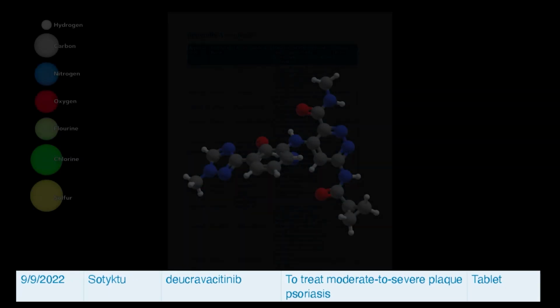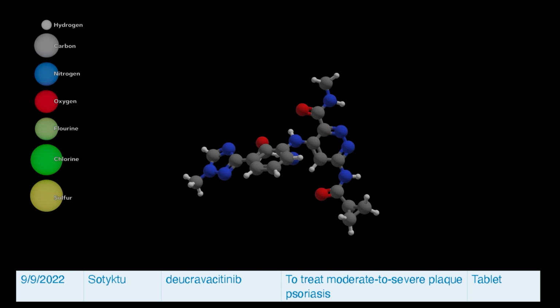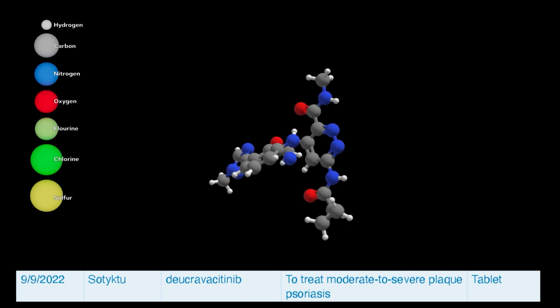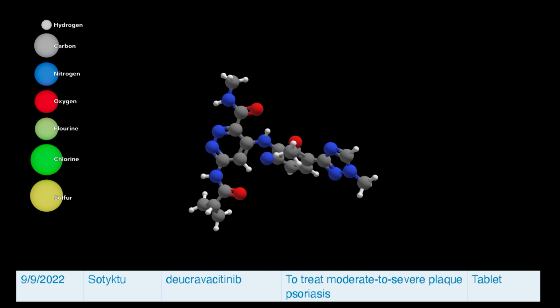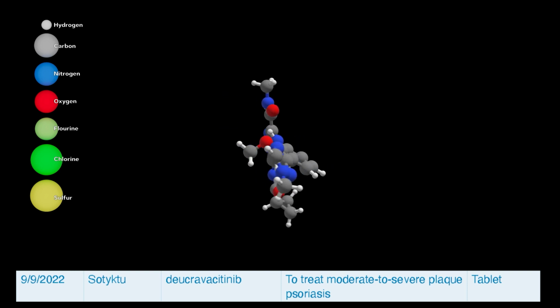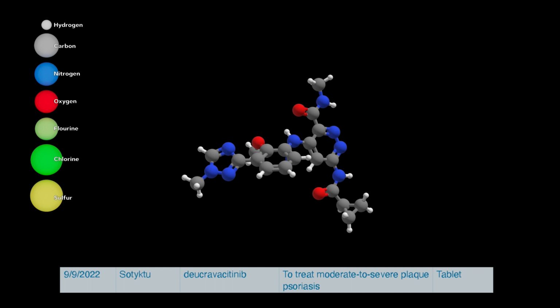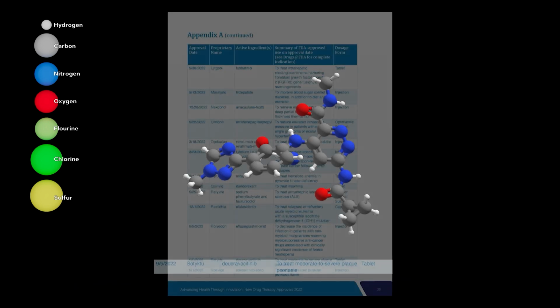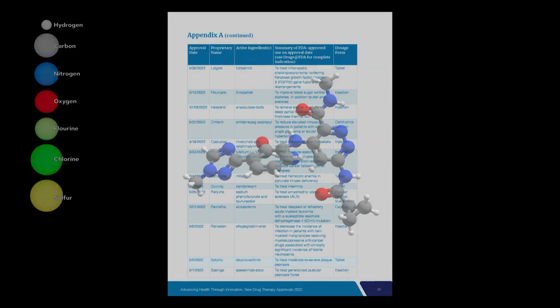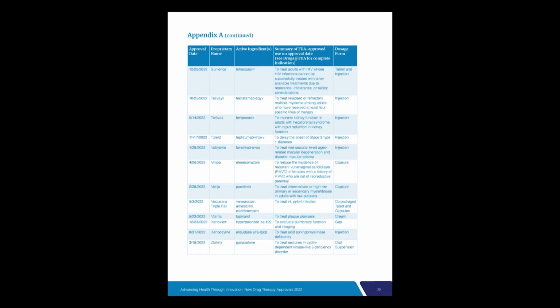Step 5. For stability testing. HPLC is utilized to evaluate the stability of drug compounds under various conditions, including temperature, humidity, and exposure to light. By monitoring the degradation of compounds over time, researchers can assess their shelf life and optimize formulation strategies.